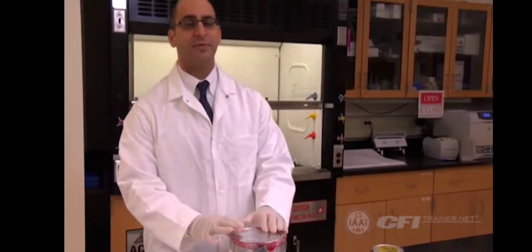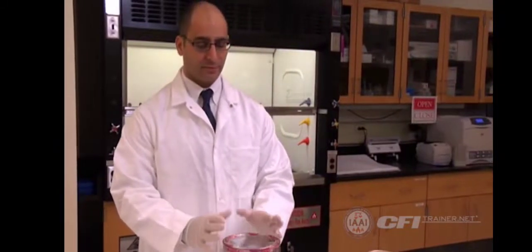Some of the more common issues that we face in the laboratory with fire debris samples for ignitable liquid residue analysis are usually related to packaging. Oftentimes the cans are compromised, the lids aren't on properly. If too much time has passed, the metal cans can rust. And once they rust, they will develop little tiny holes where the vapors are going to escape. The whole purpose of the packaging for ignitable liquid residue analysis is to confine the vapors and hold them in the can. If the integrity of the can is compromised, you're going to lose those over time. And if too much time passes, you're going to lose everything.